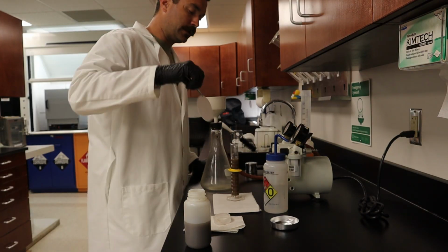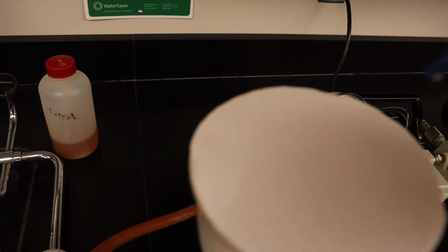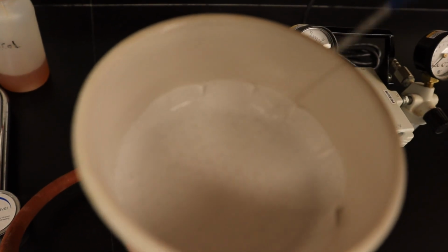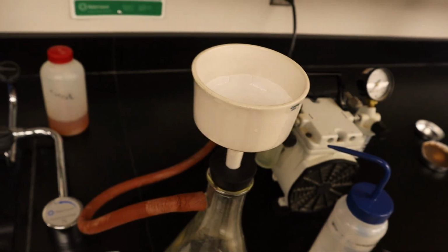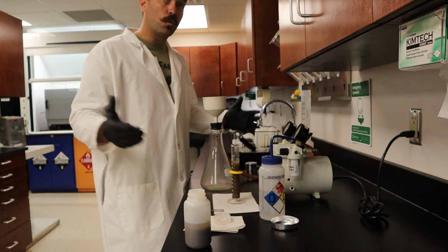When I say seat the filter here, we're going to lay it on top of our funnel. And then I'm going to use my DI water bottle. I'm actually going to gently squirt some water right there onto the funnel, and then I'm going to use the bottle itself to actually seat the filter down inside that funnel. So we'll give you a top-down view of that as we do it, but I'm going to gently just kind of press those edges. It's very important that you're gentle at this point. You don't want to tear your filter, and then you're going to have solids pouring out through there going into the flask, and that's not going to be an accurate reading. So now that we have that seated, we're ready to pour.